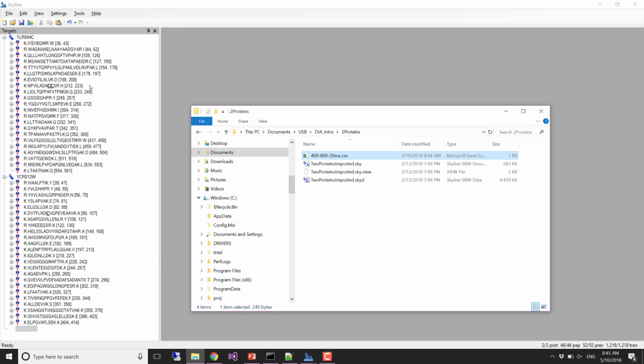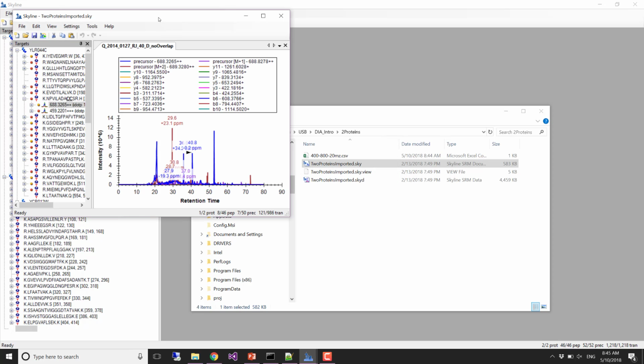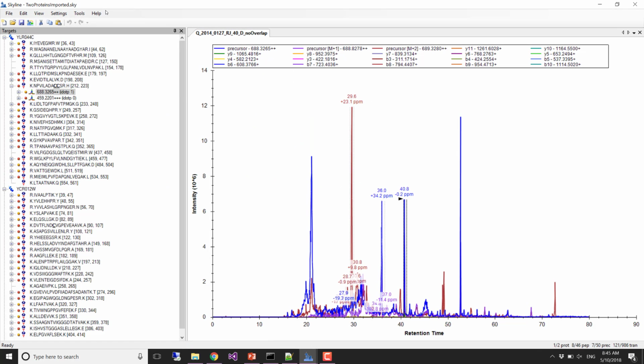We're going to do that together, but we'll take a quick look at what this looks like, because this is your completely uninformed starting point, and we're going to progress from this sort of completely uninformed way of starting with DIA to adding progressively more information from various sources and seeing how prior knowledge and more information helps us.